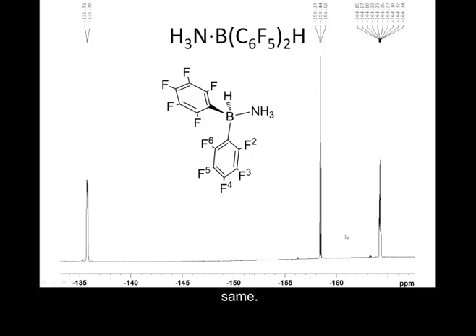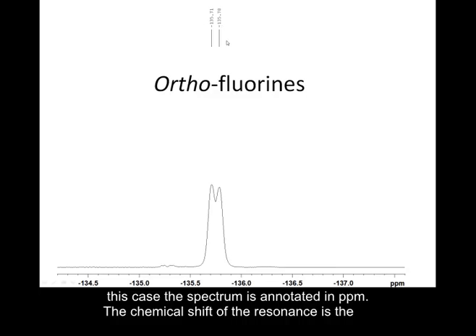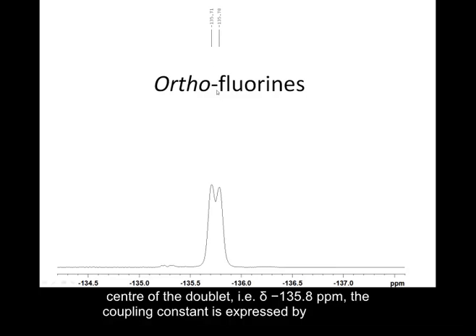We see three signals in this fluorine NMR, but we need to zoom in on each of those signals to see what is going on. If we zoom in on the ortho-fluorine resonance, it appears as a doublet, because it's split by the adjacent meta-fluorine. The spectrum is annotated at the top with the peaks picked out in ppm. The middle of this doublet comes at minus 135.8 ppm, which is the chemical shift of the doublet itself.